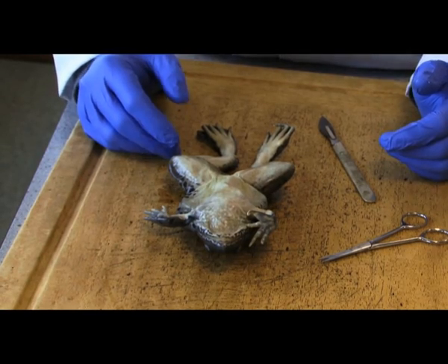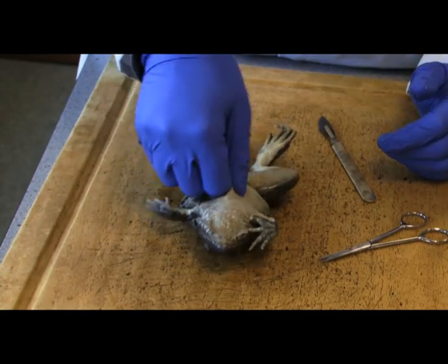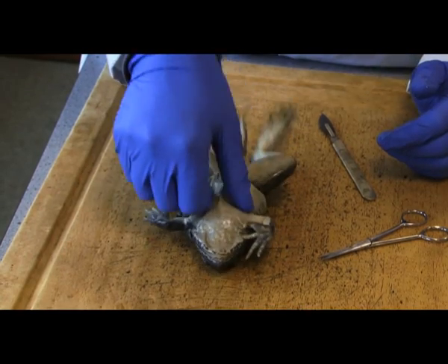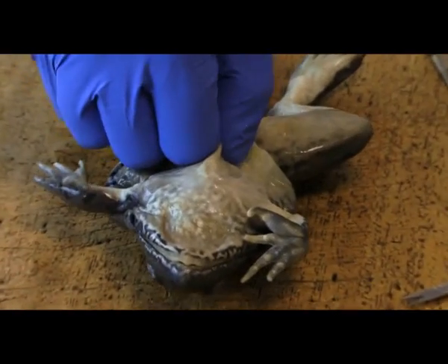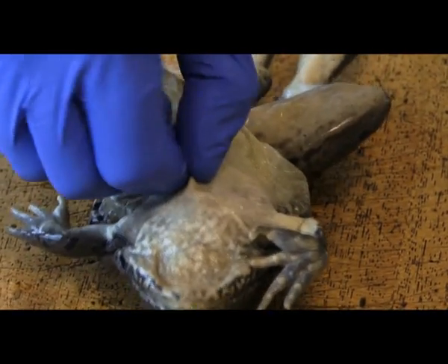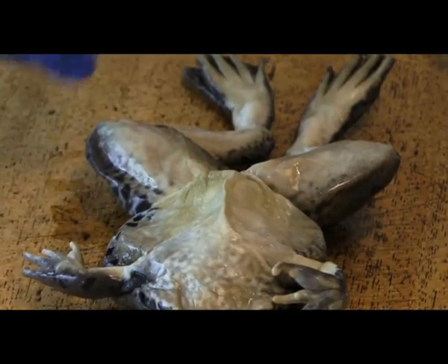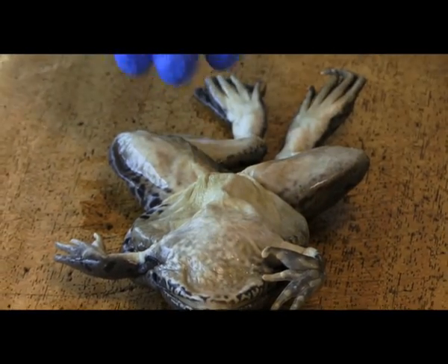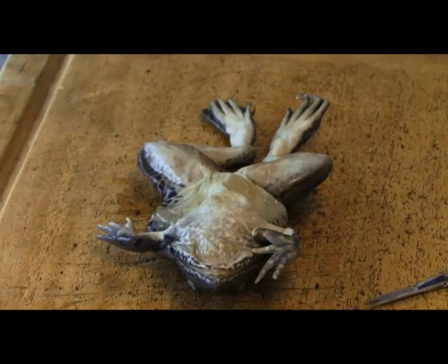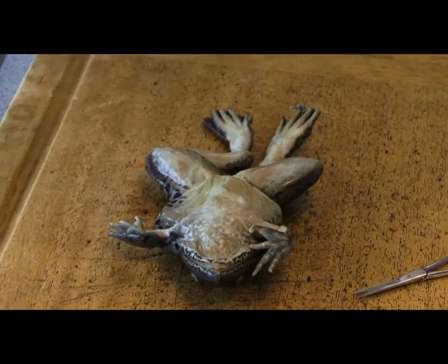What I normally do is I normally pinch the thoracic abdominal cavity, and the whole purpose of pinching is because you've separated the connective tissue from the skin. So when you do go to make your incision, if you've not pinched it, it could go directly straight to the vital organs, which will not allow you to visualize the correct organs, or the organs could get damaged on the inside.